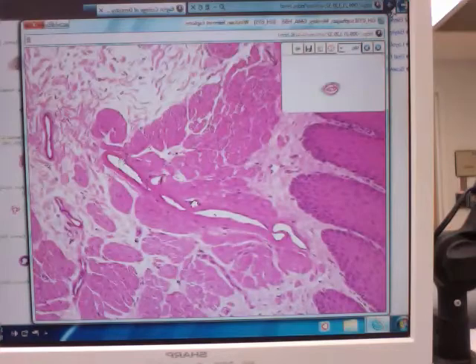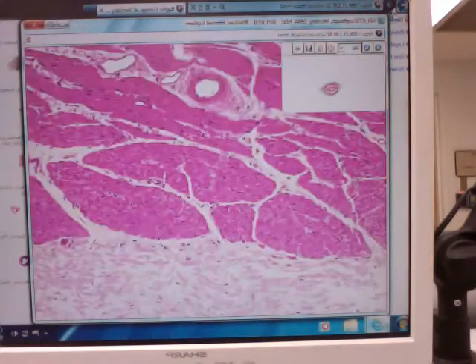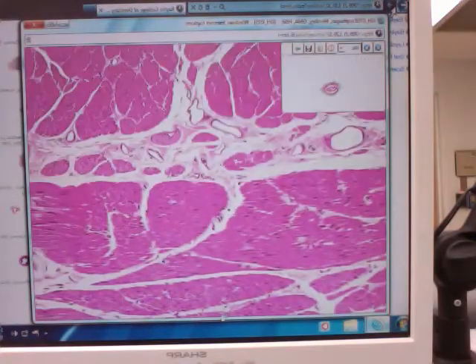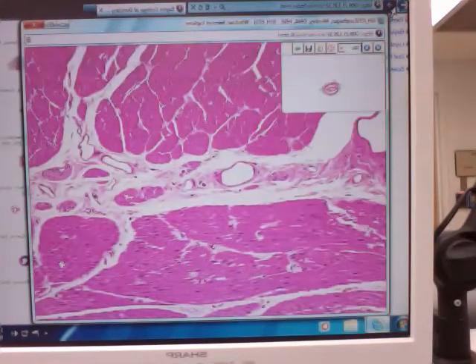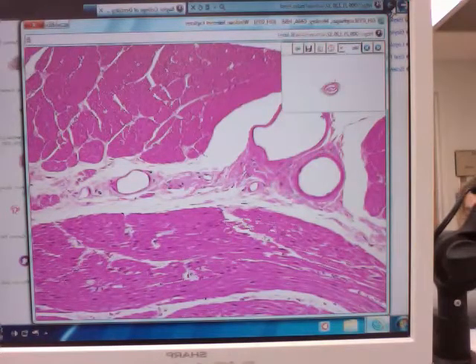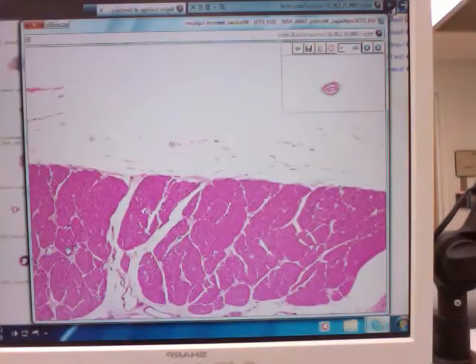Pockets of muscle you don't care anything about right now. We wouldn't go into all that shredded tissue and ask you questions there. But even when you look around, you'll typically see around these blood vessels some nerve fibers. All this stuff is loose connective tissue surrounding this blood vessel, this blood vessel. So you'll find all those little pockets of it as we scan around.